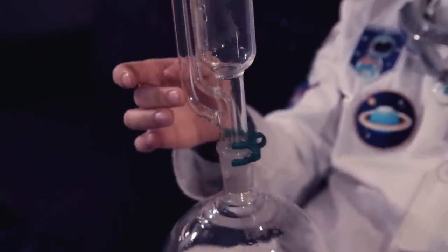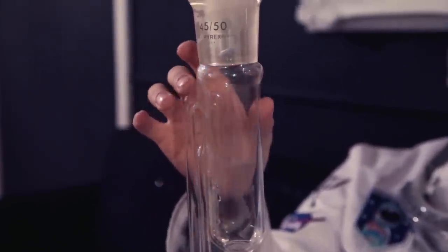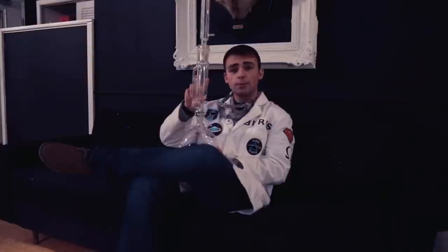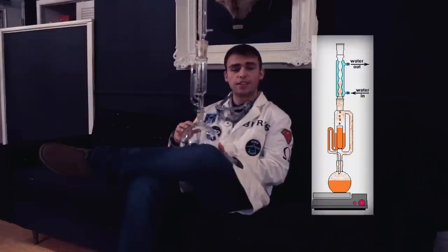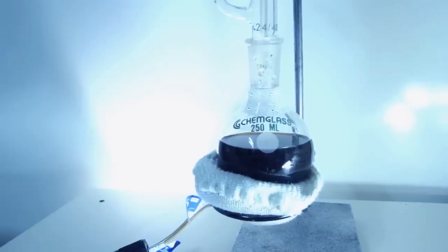As the vapors travel up this sidearm, they will meet a piece of glassware which will condense them and cause the liquid to collect here in this chamber. When this chamber is almost completely full, a siphon begins because of this small sidearm, and all of the solvent is drained back into the flask, so that way the cycle can be repeated. So we can take our coffee, and now we're ready to extract the caffeine out of it.